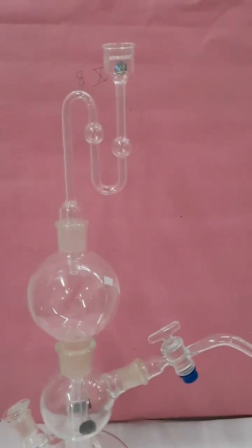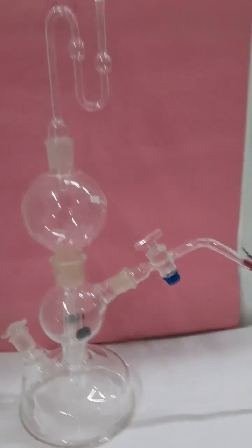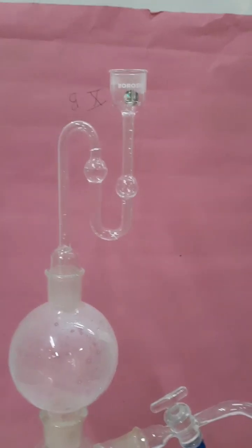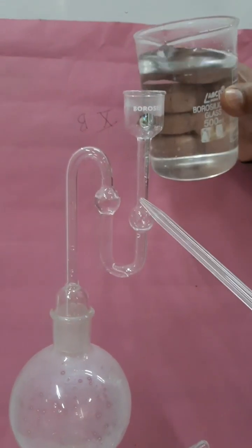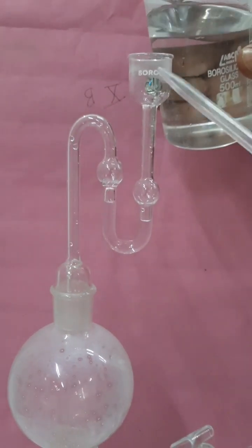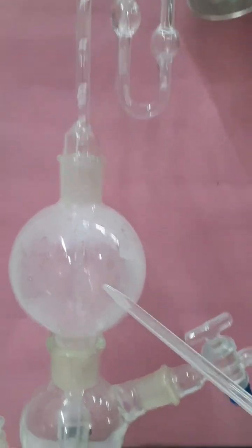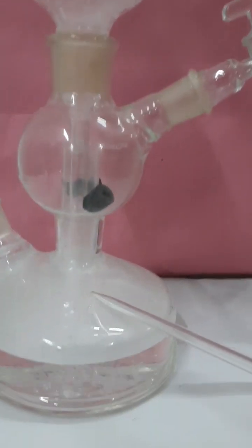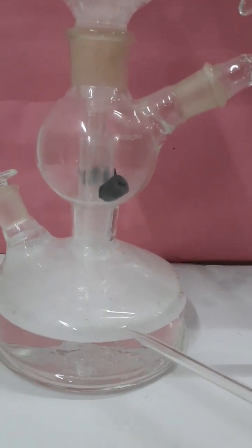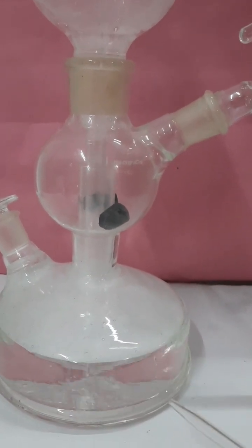This is the knob to remove the unused acid. Now I am going to explain the preparation of H₂S gas with the help of Kipp's apparatus. I am adding dilute sulfuric acid into the thistle funnel. It passes through the long tube into the third chamber. There is no direct contact between the first chamber and the middle chamber.